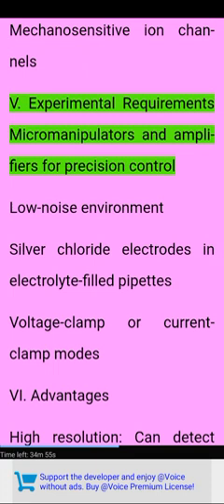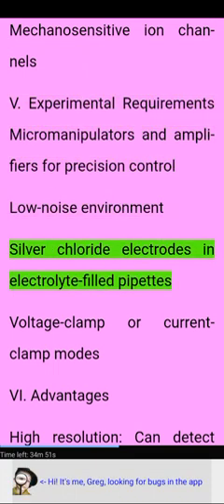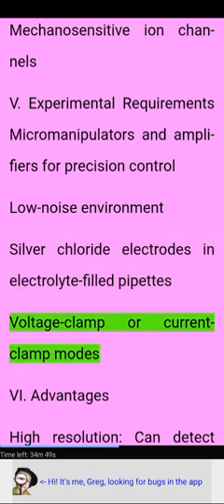The experimental requirements: micromanipulators and amplifiers for precision control, a low noise environment, silver chloride electrodes in electrolyte-filled pipettes, and voltage clamp or current clamp modes.